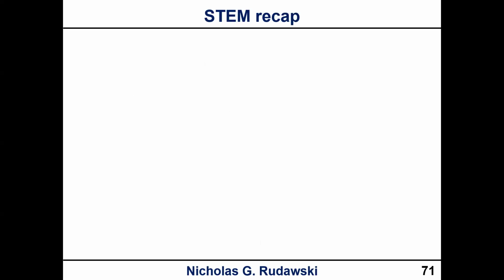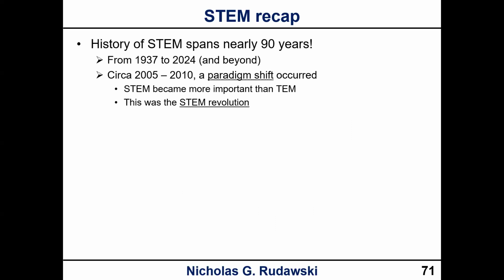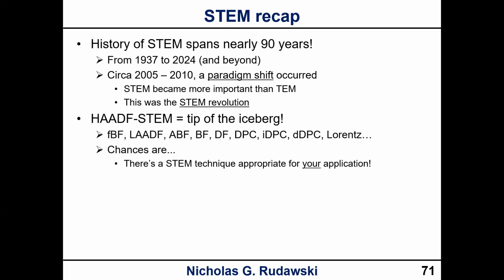Okay, two slides left here. Just to recap, the history of STEM spans nearly 90 years, from 1937 to 2024, and of course beyond. I'm calling the time between 2005 and 2010, when the paradigm shift occurred and STEM became more important than TEM, what I call the STEM revolution.